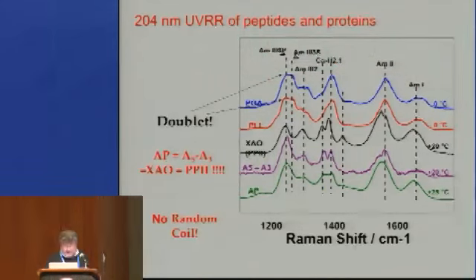structure and dynamics. And here, for example, are a series of spectra of polyglutamic acid, poly-L-lysine, XAO. This is a synthetic peptide made by Kallenbach, I'm going to tell you about in a minute. Here is the spectrum of alanine 5, from which we subtracted alanine 3 to calculate the spectrum in the middle of this peptide. And this is a mainly polyalanine peptide.